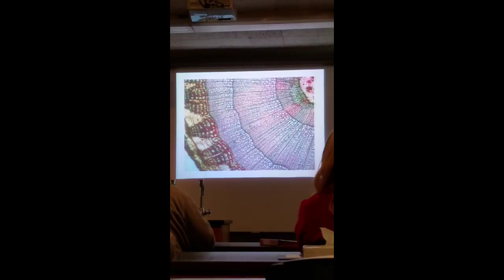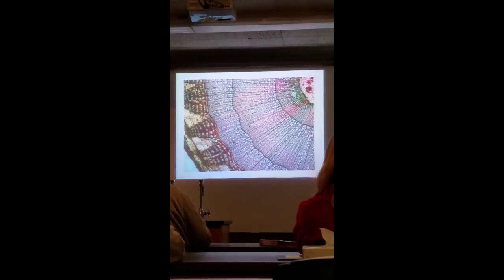Vascular cambium. All right, and so this stuff right here, if this is the vascular cambium, that means we have xylem towards the inside and phloem towards the outside. And then, of course, phloem also makes up part of this layer, which is bark, basically. Okay.